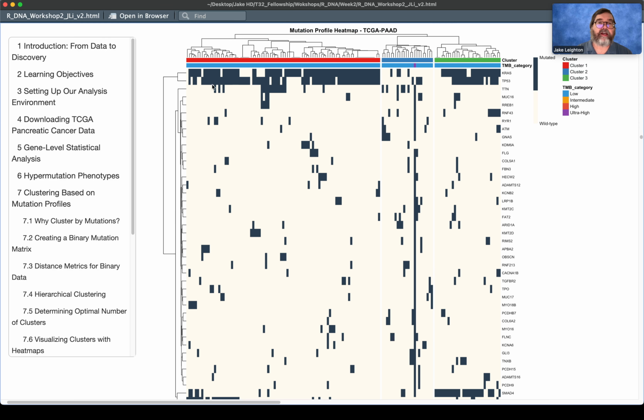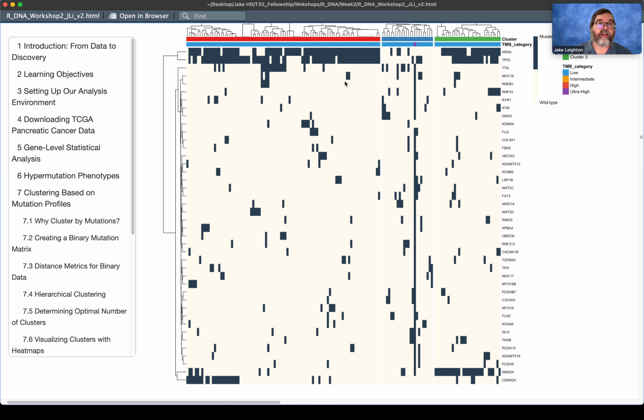And what's going on with the red cluster? Well, once again, we have mostly KRAS and TP53. And that's what separated it out, I think. What separated this thing out, I think, the most is not having, these have nothing, right? Or pretty much nothing. So that's why they're separated. What's the difference between this and this? So what's different? Why green separated out was because of this SMAD4. So that's why you got all of this. And then all that's left is the TP53 KRAS, right?